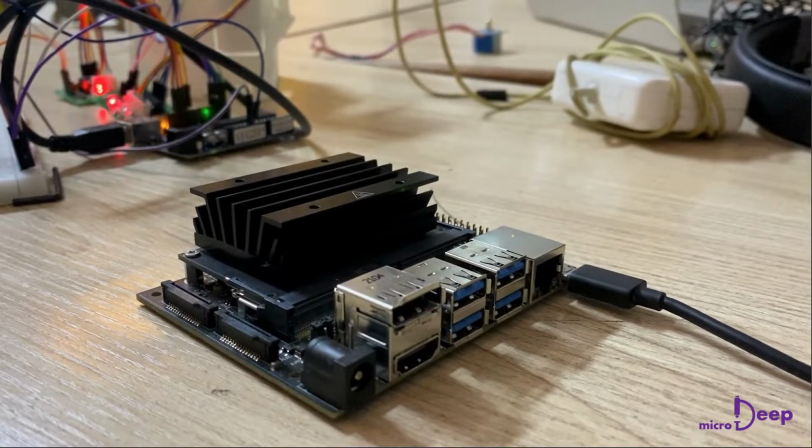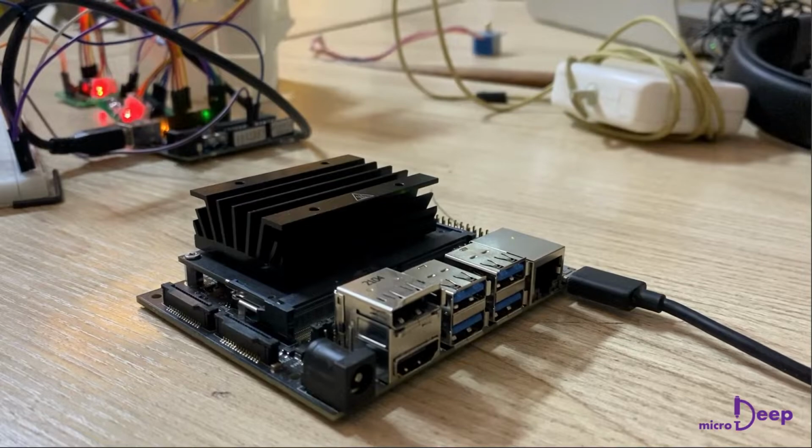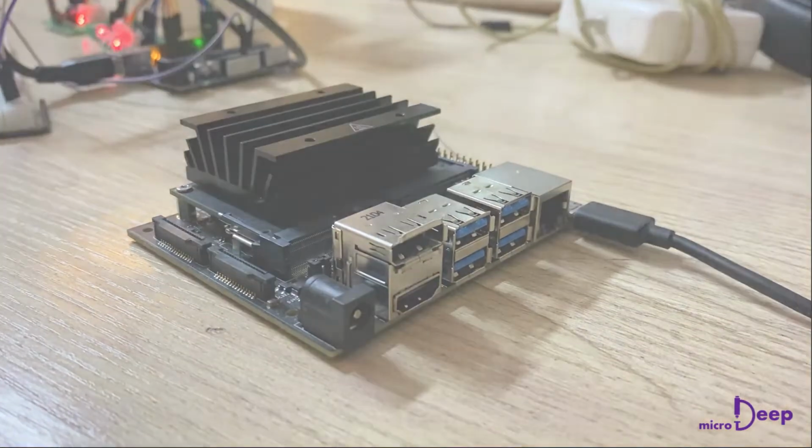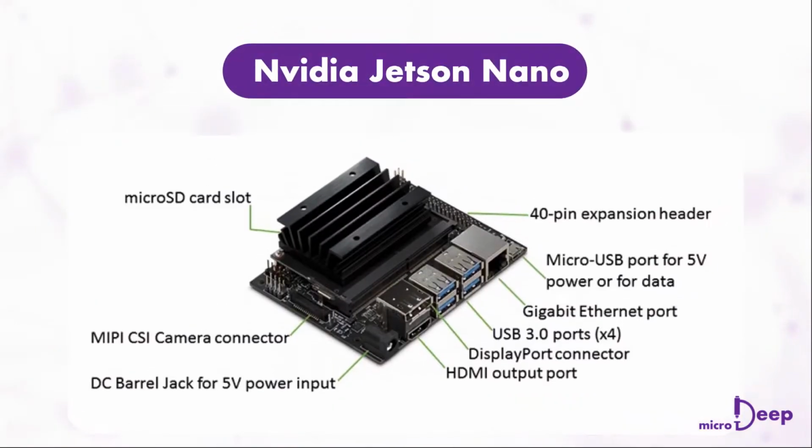After the trained deep learning model was ready, it was deployed on a NVIDIA Jetson Nano to achieve real-time analysis of acquired images. NVIDIA Jetson Nano is one of the most advanced microcomputers dedicated to embedded deep learning applications.